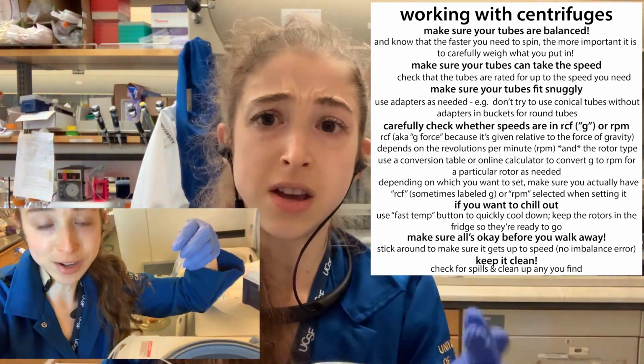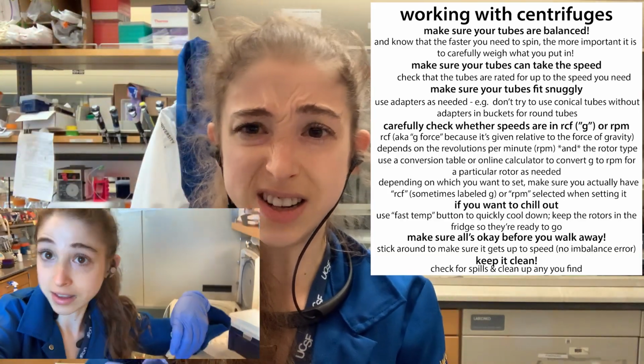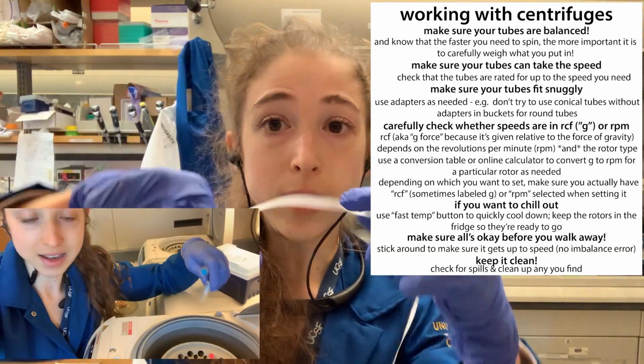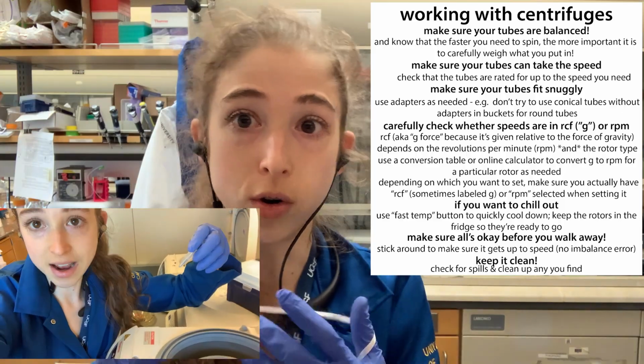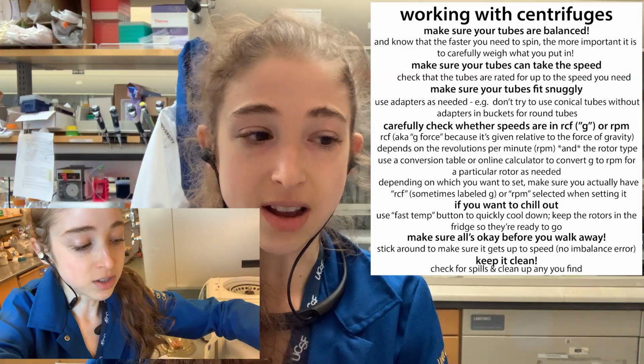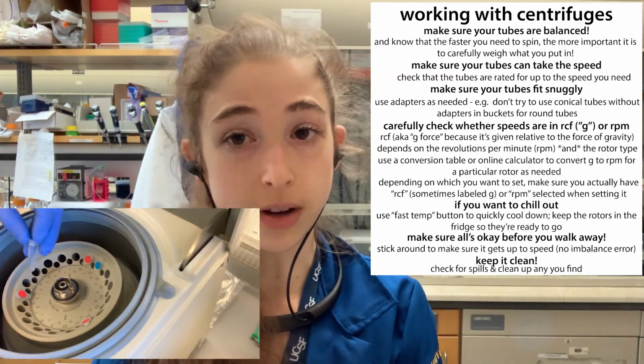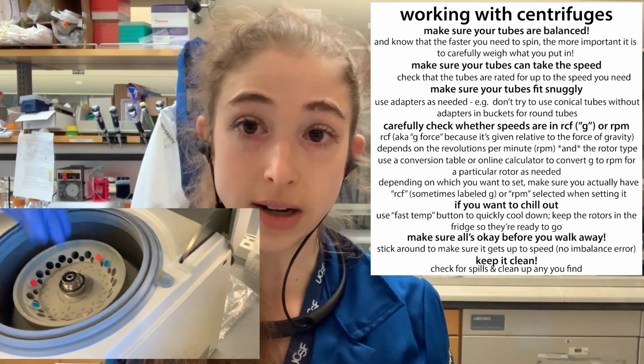And if you have 3 or something, you can space them out evenly, and more on spacing out in other posts. But the faster you go, the more important it's going to be that you're really balanced. With little things, it's not as big of a deal, but when you're dealing with ultracentrifuges, you want to make sure that you're doing it really carefully, and I'll do more on this in a practical post. But that's basically the basics.